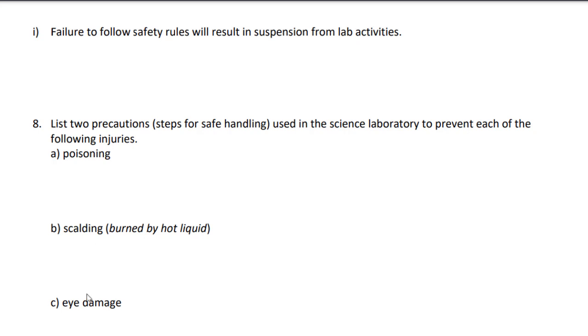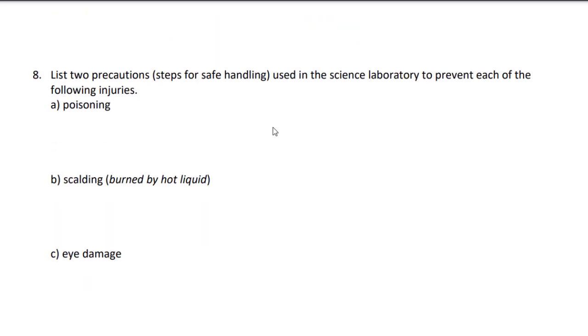These 3 questions here, I guarantee you, are test questions. These are on your quiz. So you want to make sure you have really good answers for them. When we say precautions or steps for safe handling, we're saying, what are you trying to do to make sure that you never get injured? Not what do you do after you get injured, but what do you do to prevent yourself from ever getting injured in the first place?